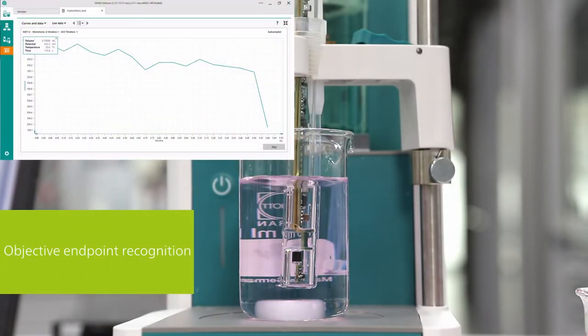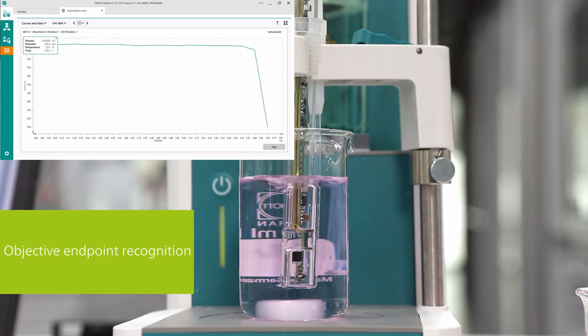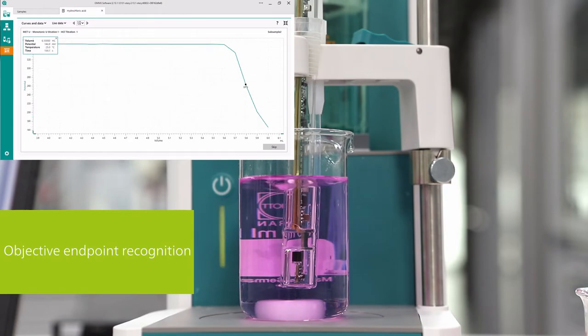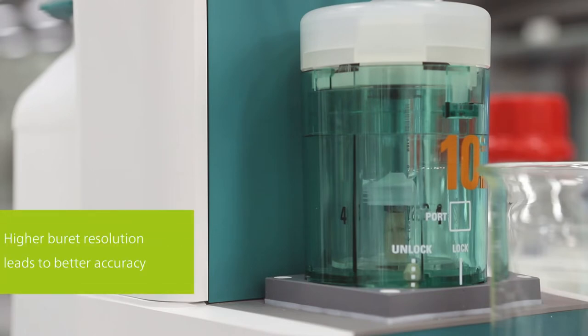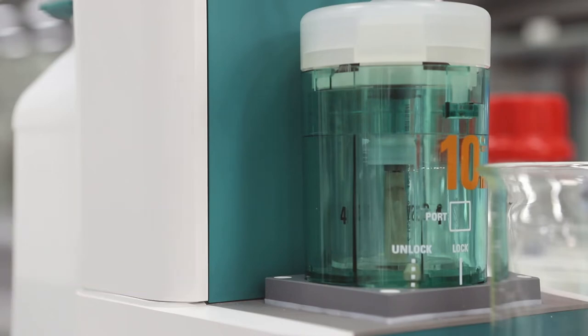Moreover, reading the volume from the burette can also be tricky. If you do not read the volume horizontally, you will obtain an incorrect result. Using an automatic titrator and sensor renders these issues obsolete. First, the sensor detects the endpoint objectively. And second, the burette of an automatic titrator has a much higher dosing resolution. Therefore, results calculated by the titrator are more accurate and reproducible.